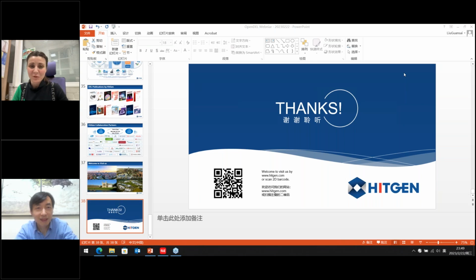It's very helpful actually. And the last question from me is whether OpenDEL is suitable for RNA targets. RNA target, right? Last year we had a publication in Nucleic Acids Research.